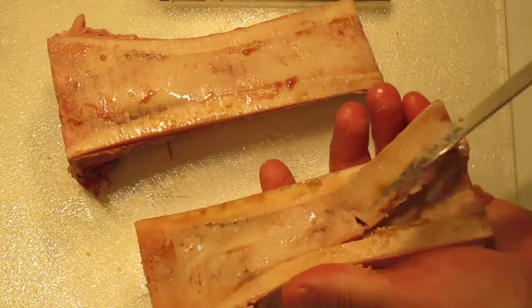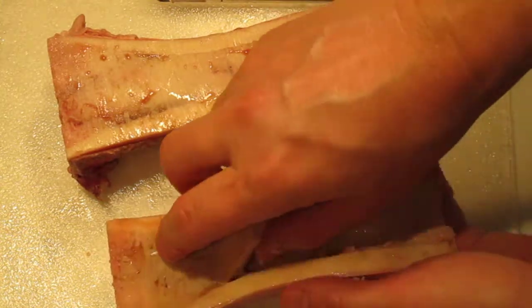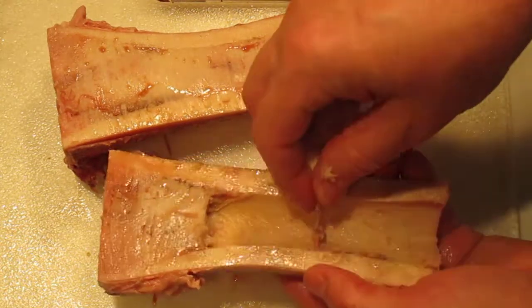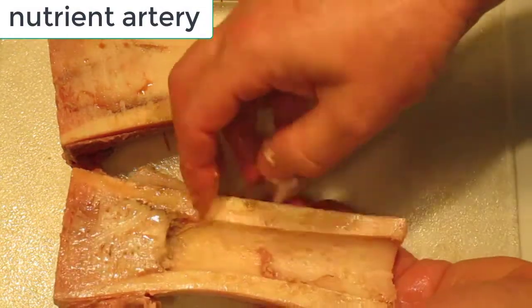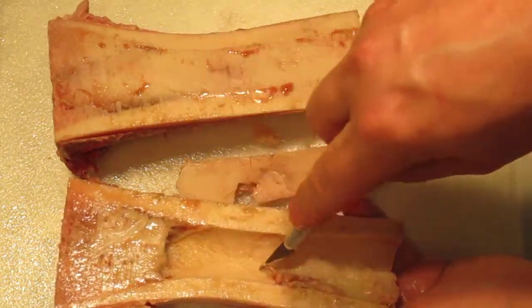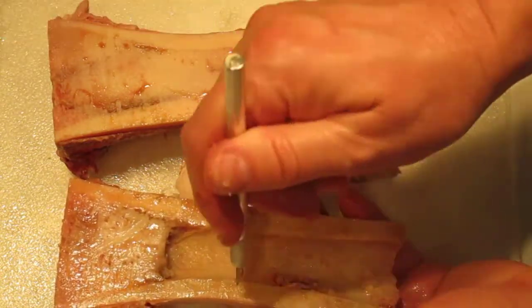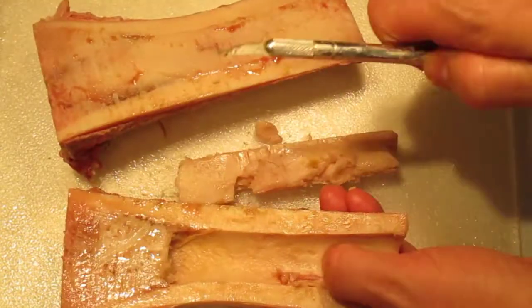There we go — we start pulling some of that yellow marrow out and it comes right out. There's a stringy part here, and this is the nutrient artery — an artery coming into the fatty tissue. This is your medullary cavity. You can see this is cortical bone — it's this half-moon or half-pipe shape all through here.